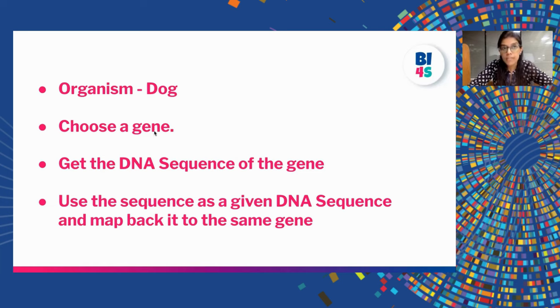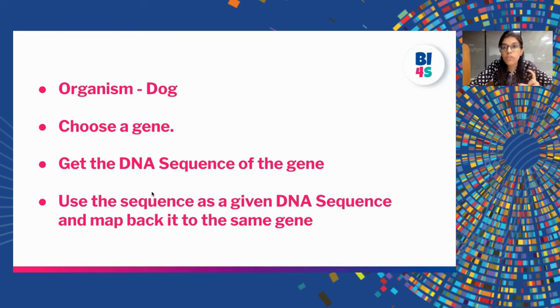For today's exercise, we will be looking at the organism known as dog. We will choose a gene from the dog's genome, get the DNA sequence of that particular gene, and then from the FASTA sequence of the gene, we will take a segment of the sequence as a given DNA sequence and then try to map it back and see if we land at the same gene again.